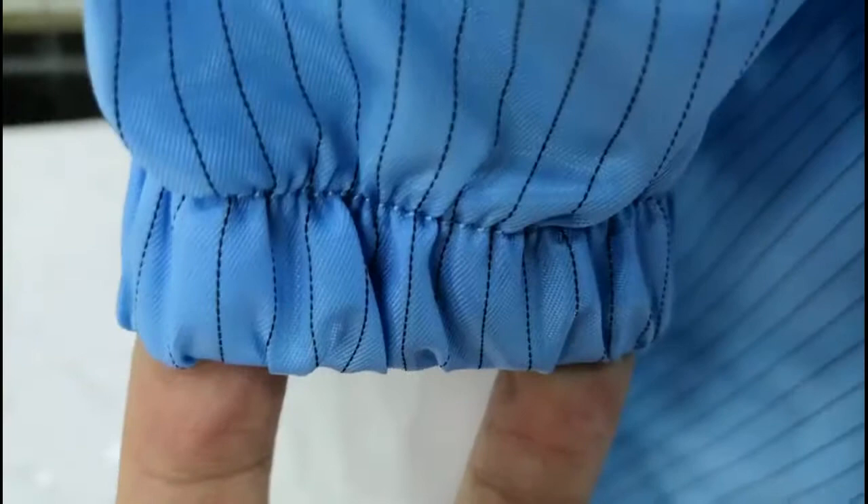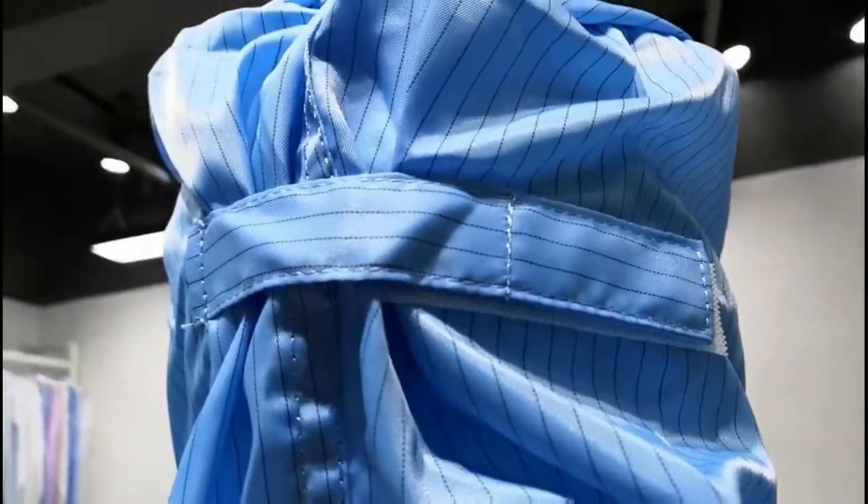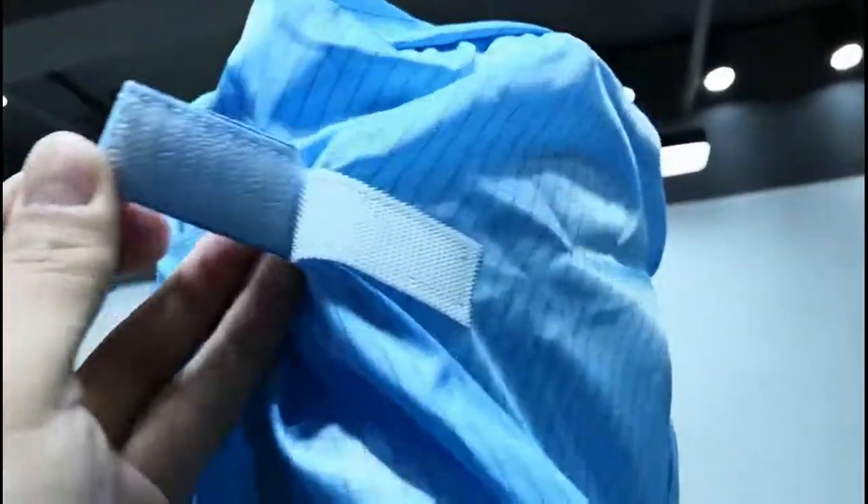We have elastic here, here, and here, to make it super flexible. You can adjust the size of the hood by adjusting this part.